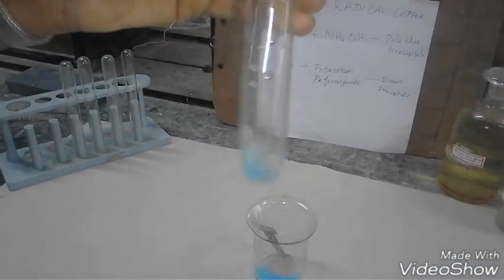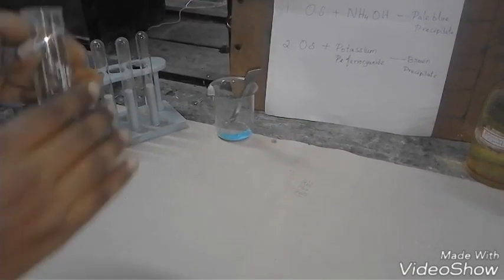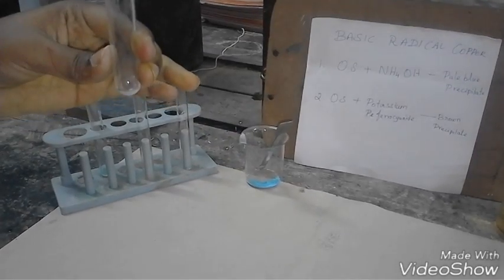We are now going to prepare the original solution using distilled water. Pour a small amount of distilled water into the boiling tube containing copper sulphate salt. Mix it thoroughly till the solution is homogeneous. Transfer a small amount of solution into 2 test tubes.